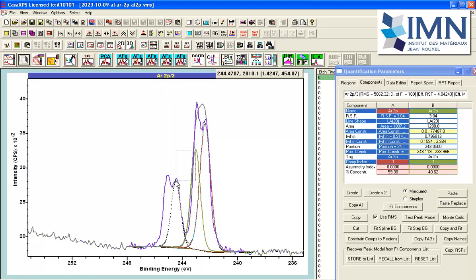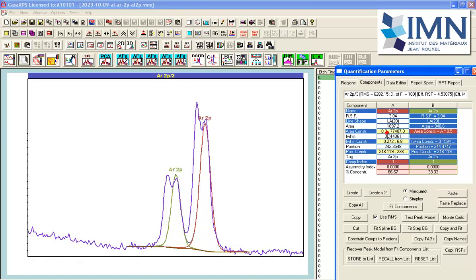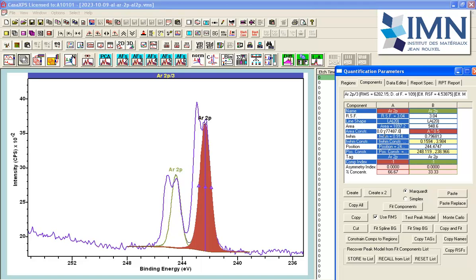move that on the basis of my previous discussion that I need to have peaks appearing in pairs that have a given relationship in intensity. So I'd like to now impose the relationship that this is a doublet peak from a p orbital by ensuring that the area between these two components are in the ratio 2:1. So now that I've created a doublet pair, I can create another doublet pair easily by copying these.